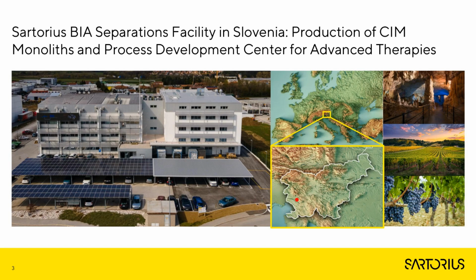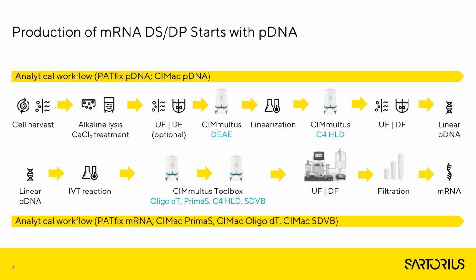Today we focus on non-viral delivery systems, so plasmid DNA, mRNA, LNPs, but we also work on gene therapy vectors like AAV, lentivirus, and so forth. We would really like to take you through the entire workflow of what it takes to come to a highly purified LNP to deliver a nucleic acid payload, but we have to unwind the story quite a long way back, and we have to load the LNP with mRNA, but before we get to mRNA, we have to actually make highly pure plasmids.